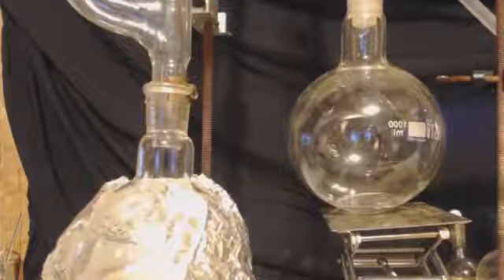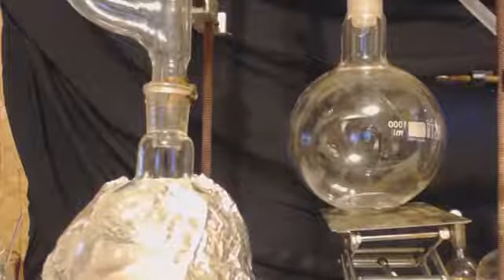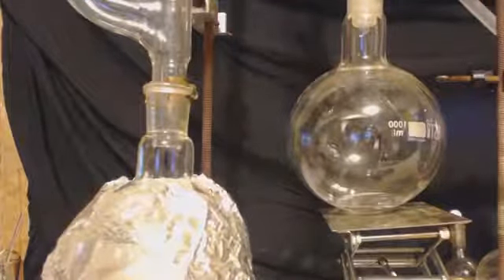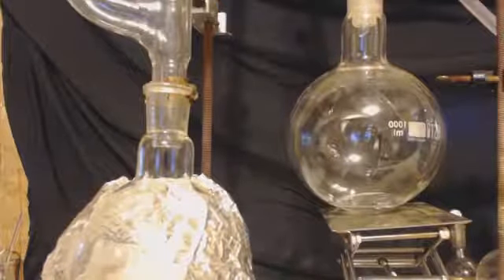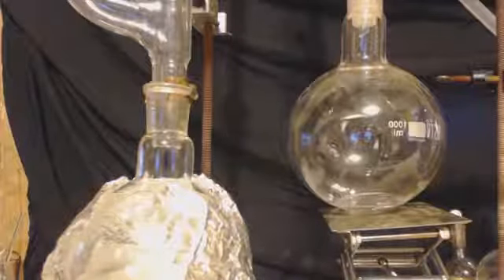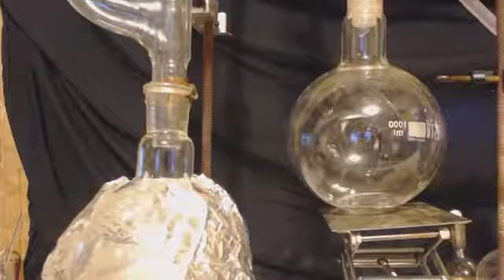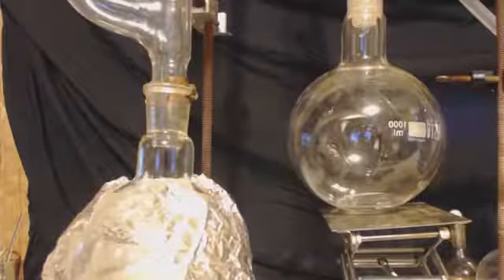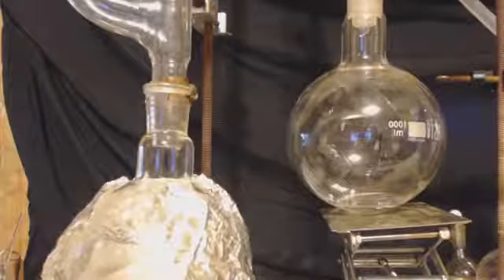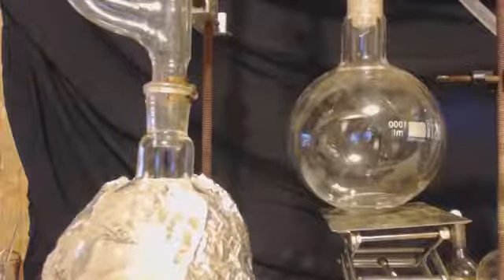So anyways, here's my drip rate. I did this at a pretty good drip rate. Basically, it shot up to almost 63 right off the bat, and it stayed there the whole time. I didn't let it go up past 64 until the very end, and even then I only let it go up to 65. The azeotrope, I think, was at 64.3 or something like that.